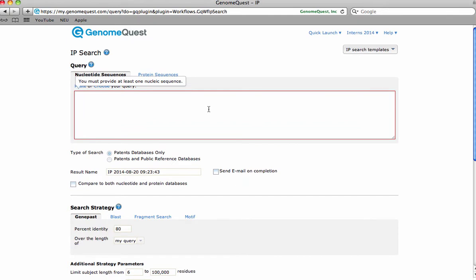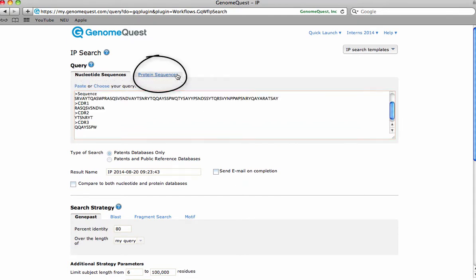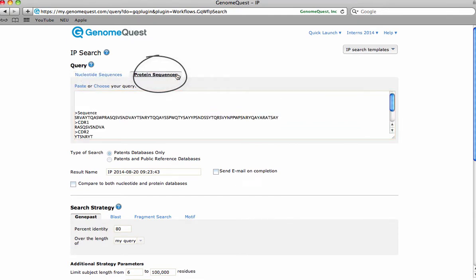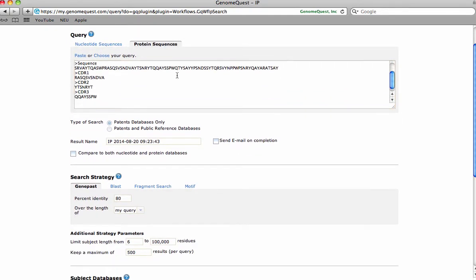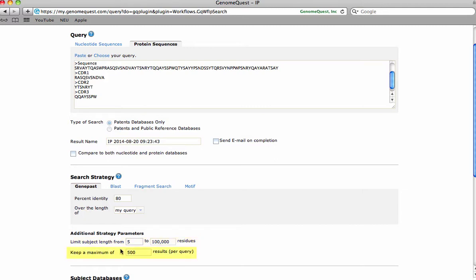Be sure to click the Protein Sequences tab. The GenePass search strategy is selected to ensure individual CDRs don't get broken into pieces. The parameter Limit Subject Length From is changed to 5 in order to catch more CDR fragment results. The maximum number of results is changed from 500 to 100,000 in order to expand results.